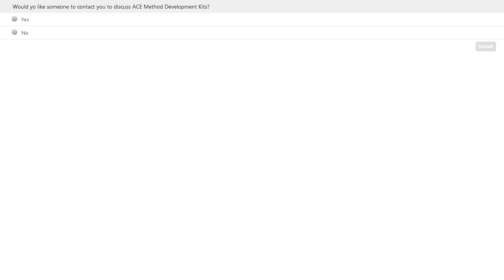A question that came in early on, referring to one of your earlier slides. Someone asks that they've always approached development by addressing chemistry prior to physics. That is, the type of stationary phase, the organic solvent choice, before things like considering temperature, gradient profile, and column dimensions. This person believes that the physical parameters may have more predictable outcomes. It seems that you've listed these as 3rd and 4th in your experiments, and the person asks why.